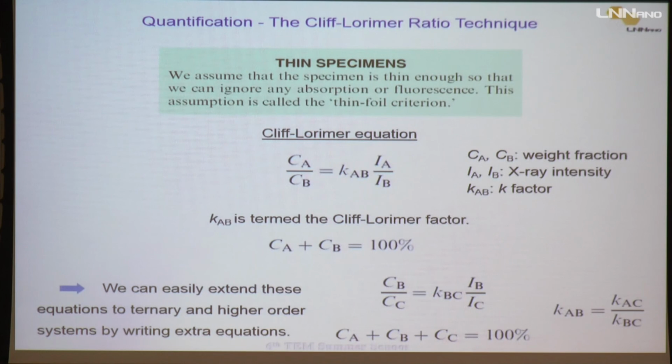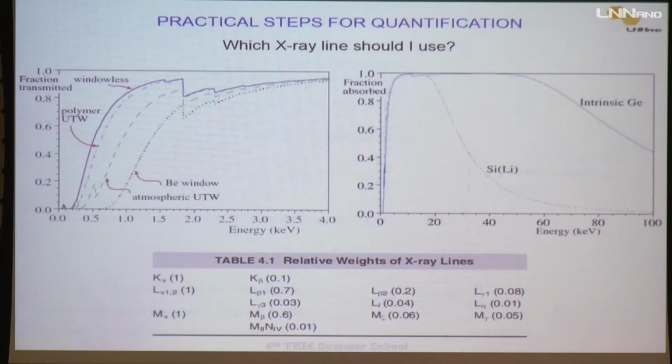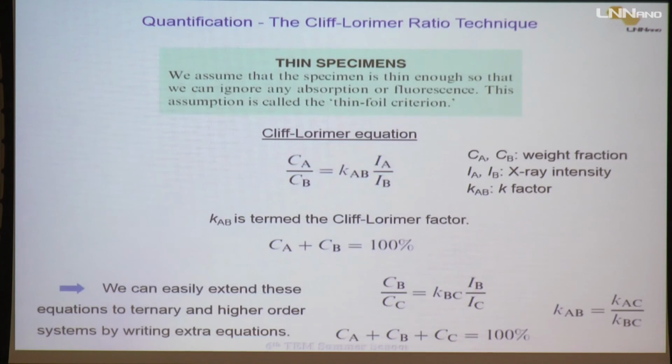You just integrate your peak and use it for this kind of proportionality, okay? It's not that easy, it's not as easy as this, okay?